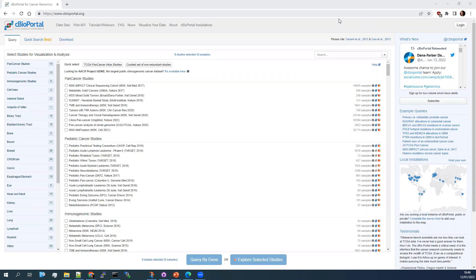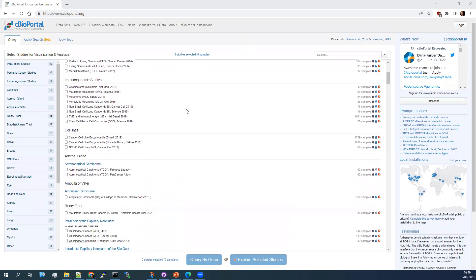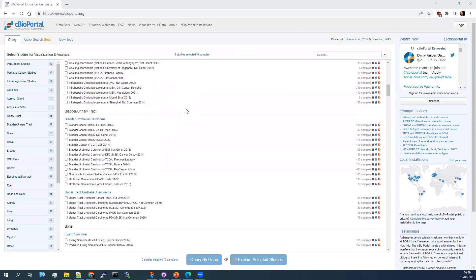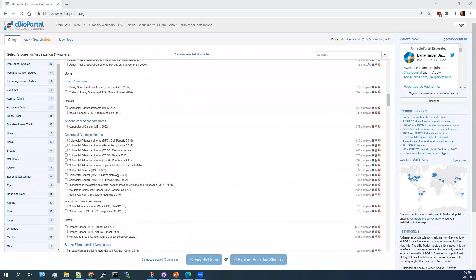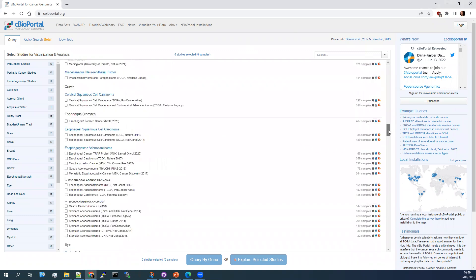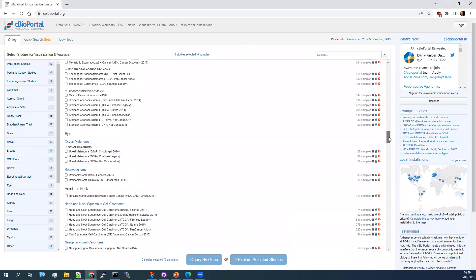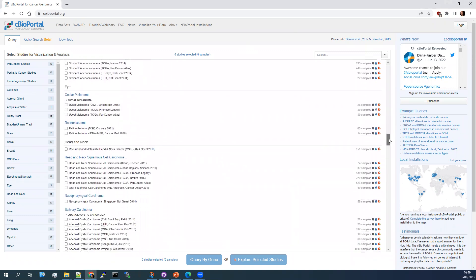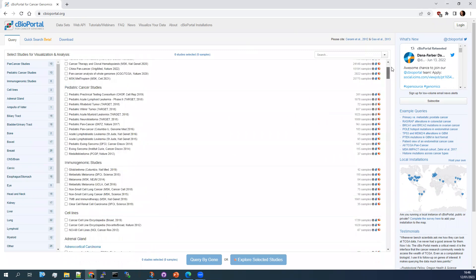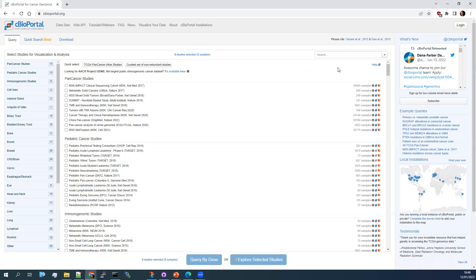So this is the C-BioPortal website. The first thing that you can notice are all of these studies. It's a very large resource, lots of different tissues, covering all the different work that you want to do. Data are all uploaded from public studies.